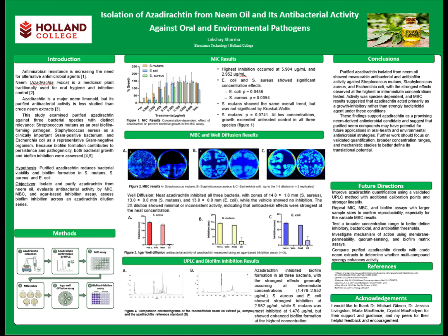Today I'm going to be presenting my project that I worked on for 6 weeks, which is isolation and purification of azadirachtin from neem oil and evaluation of its antimicrobial and antibiofilm effects against gram-positive and gram-negative pathogens.